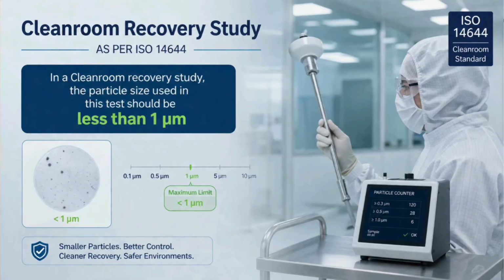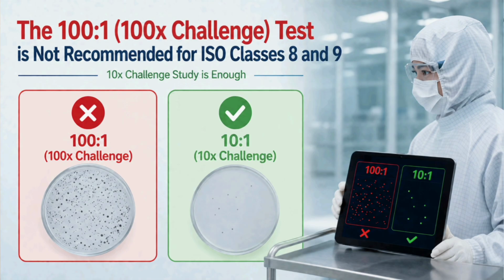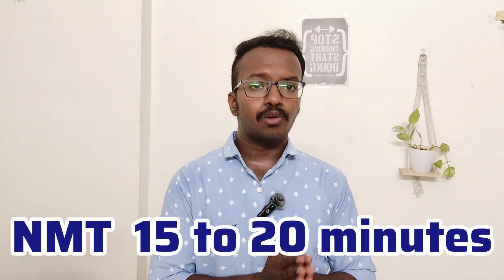And finally, two more important points from the ISO guideline. The particle size used in this test should be less than 1 micrometer. And the 100x challenge study is not recommended for ISO class 8 and class 9. For those classes, a 10x challenge study is enough. What is the acceptable limit for this recovery study? Industrial standard dictates the limit of recovery study for the cleanroom as 15 to 20 minutes.